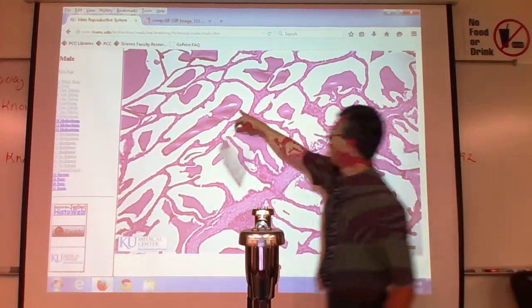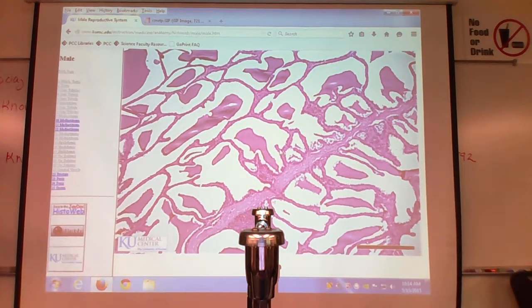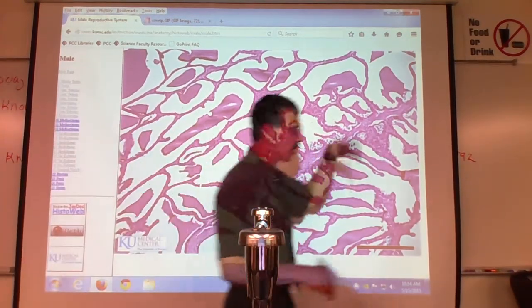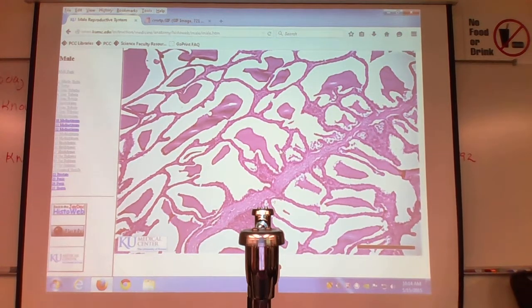Oh, here? Yeah. I think that's just how they cut it. I think they missed part of the fold there. Oh, I think that's just light. So where are the folds again? The folds are all the sponge part. The white, the red around the white part. The white part would be where the fluid is. Oh, the red would be the mucosal folds.